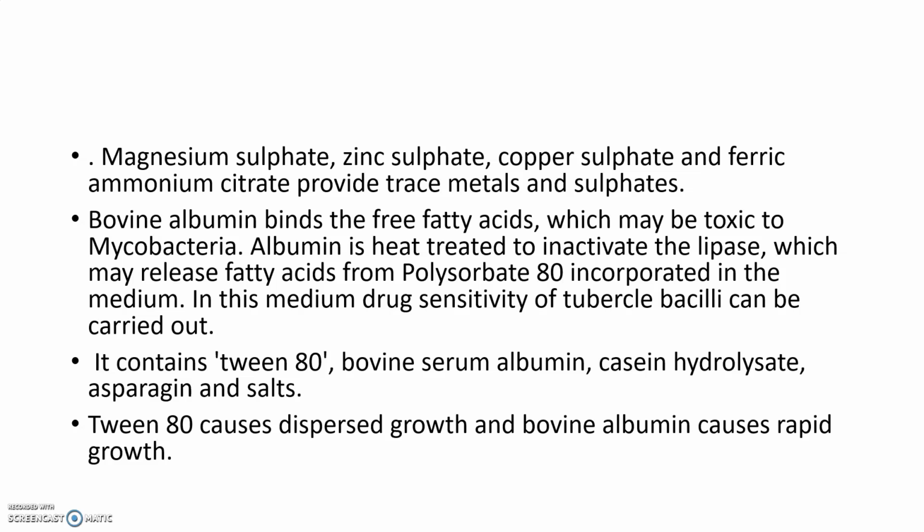Next are magnesium sulfate, zinc sulfate, copper sulfate and ferric ammonium citrate. They may provide trace metals and sulfates within the media. Bovine albumin binds the free fatty acids, which may be toxic to the mycobacterium. So albumin should be heat treated to inactivate the lipase activity, which may release fatty acids from polysorbate incorporated in the medium.